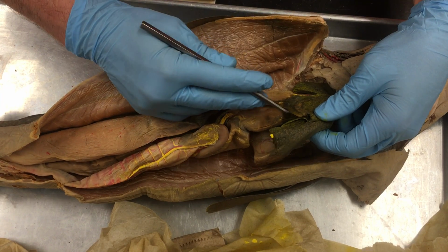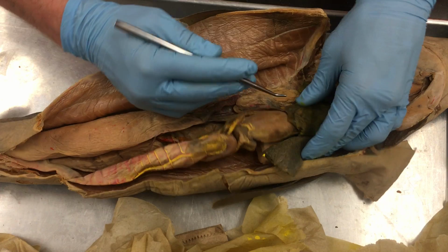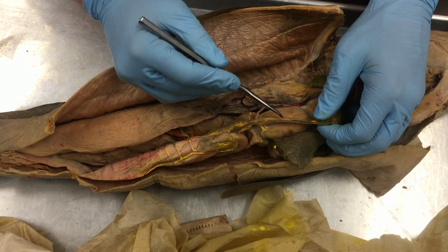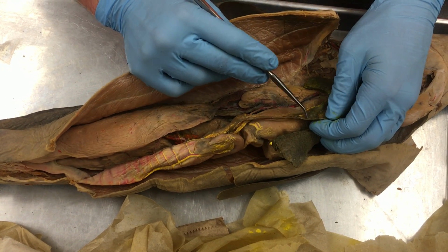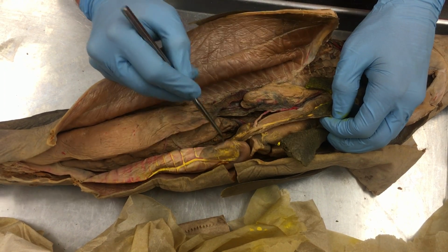I may have cut mine out because I don't really see it, but it would have been on the median lobe of the liver. Bile duct runs along with this vein. It's not injected, but it's right here and goes into the stomach and intestines.